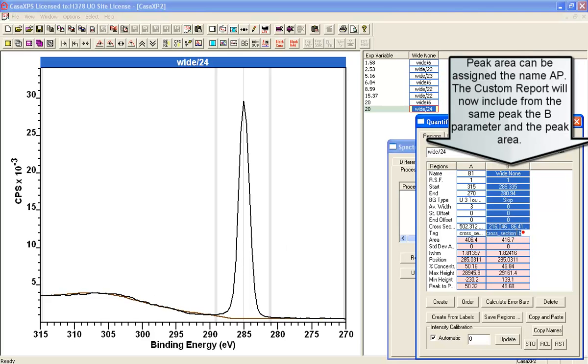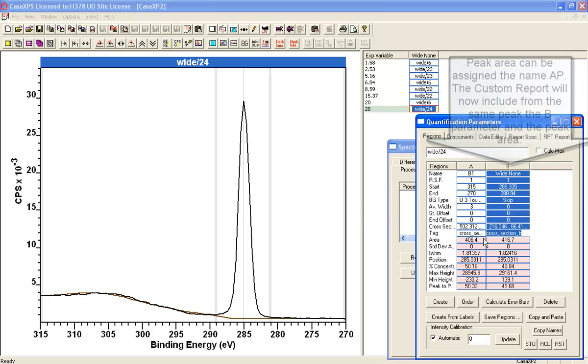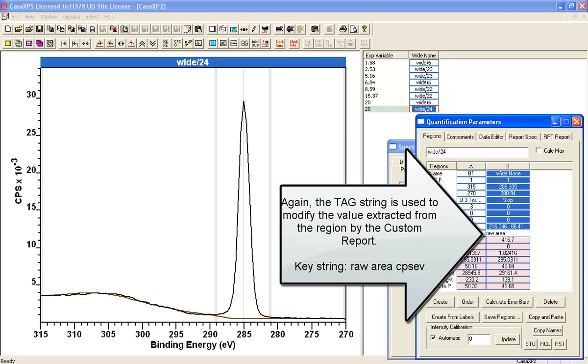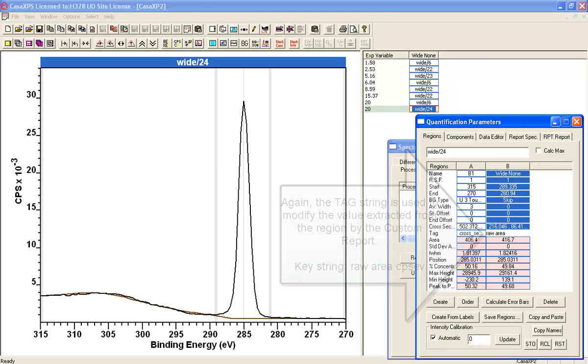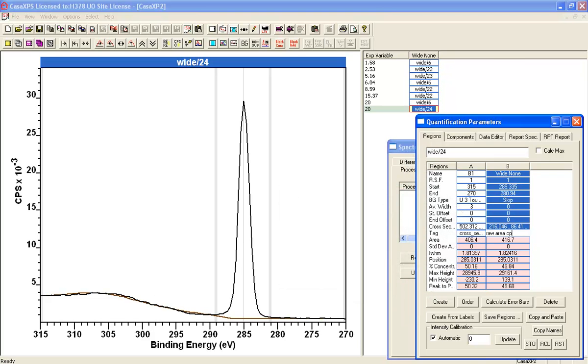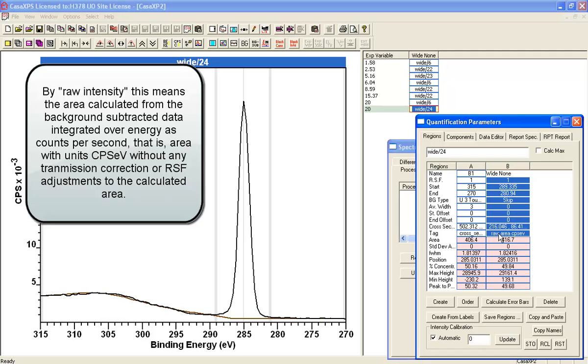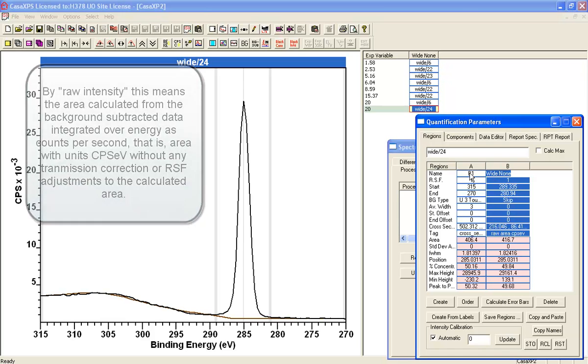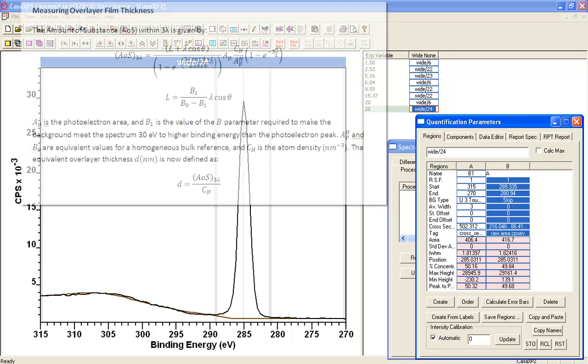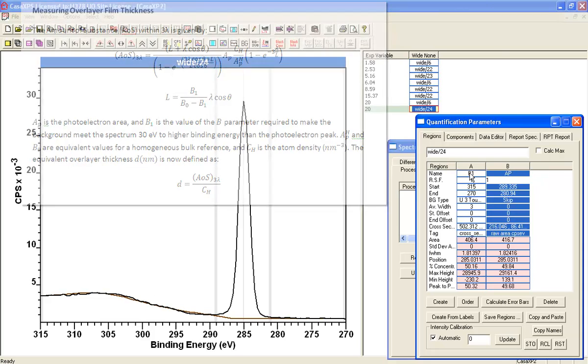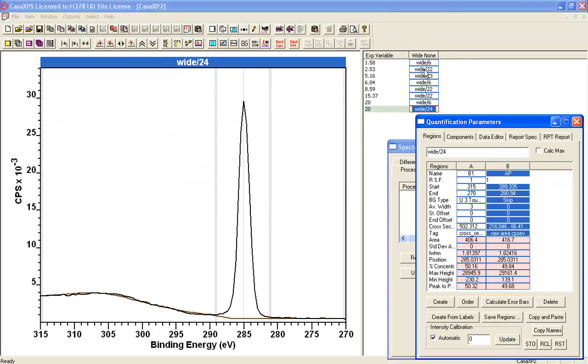Now I don't want to use the cross section. So I need to change that. And I'm going to use another key string, which is raw_area_CPS_EV. So that's going to give me the raw intensity. When I use again the custom report using tags, I'll be able to use the raw intensity. And this is going to be my AP, my area of the peak. And we'll propagate that.